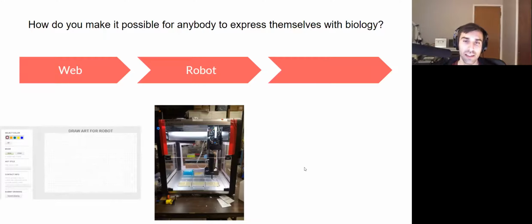I've gone ahead and made the same arrow in meme format, where the smooth brain format here is you submit to this BioArtBot cloud, you get your drawing back. Hey, that's really great. And then we go all the way up to this idea of Galaxy Brain being a part of an open source distributed bio cloud lab. We'll touch more on that a little later, but the idea is basically that we can all take these concepts and use it as a shared collaboration venue for doing DIY bio. So that's exciting.